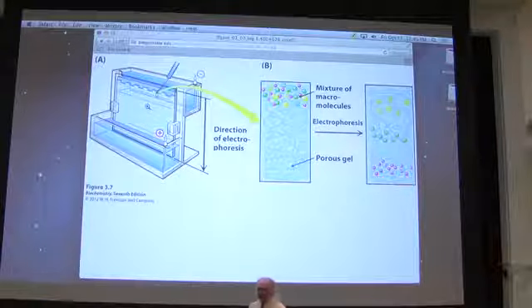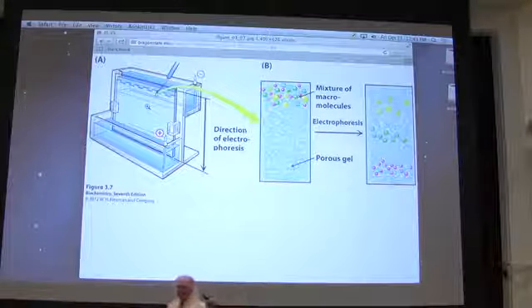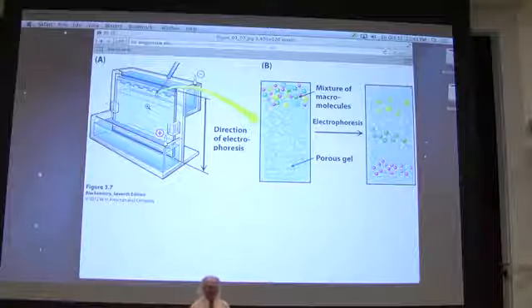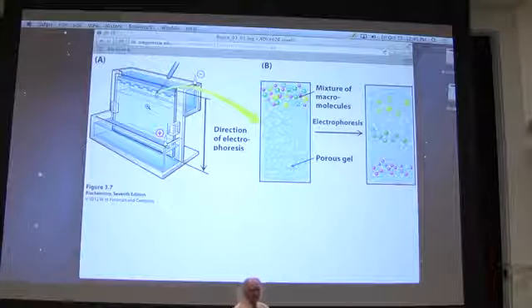So what I've just described to you is what's called SDS PAGE. SDS applied to these proteins, and then polyacrylamide gel electrophoresis. Yeah, you have a question?